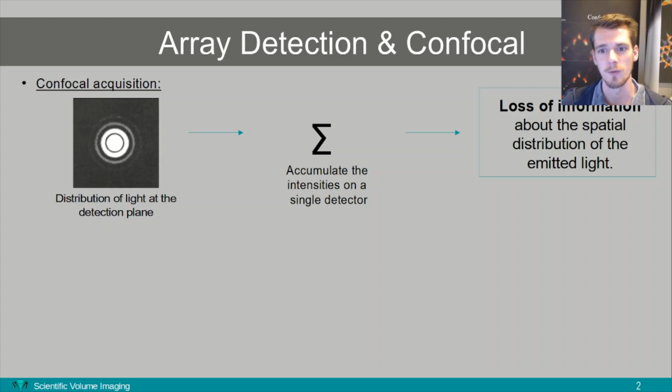During acquisition of regular confocal microscopy, a pinhole is positioned in the optical path to block the out-of-focus light. Its size is often chosen so that the first Airy disk of your emitted light is captured. By closing down this pinhole, you can improve the contrast in your images. However, at some point, you really start to lose important signal and your images will become very noisy.